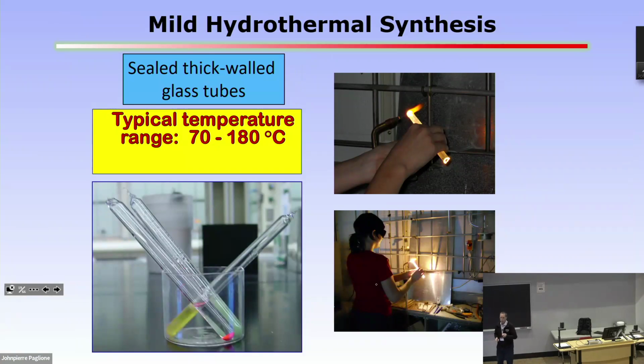One of the reasons you might want to think about that is Teflon is really great, right? It's non-stick, doesn't interact. It also doesn't really nucleate well. Glass tubes tend to nucleate better. And so sometimes if you can't get a crystal in a Teflon liner, a glass tube might get you one. Or you try to scratch the walls of the sides, and you get it in.